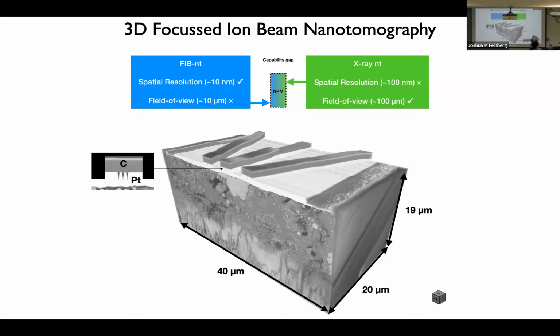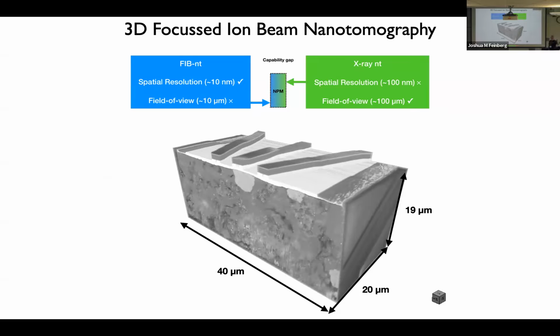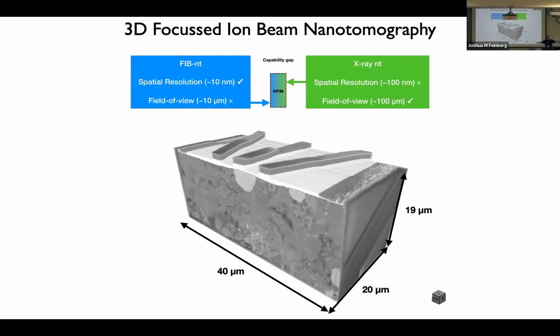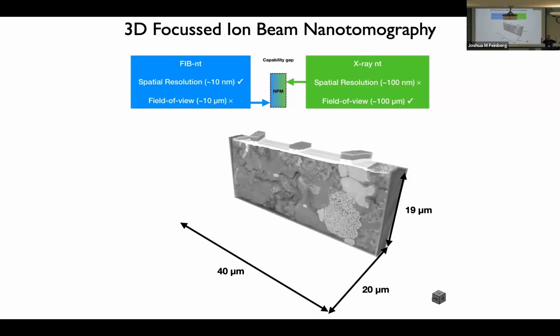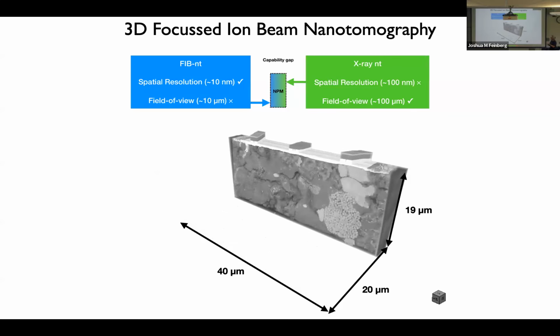And yeah, using a focused ion beam, you slice through the sample about 20 nanometers at a time. If you walk past the physics building between where we're staying and here, you'll walk past two beautiful artworks, which are a perfect illustration of slice and view in action. There's a man and a woman made of metal slices in 3D. So look out for those, because it's a perfect illustration of how slice and view works.